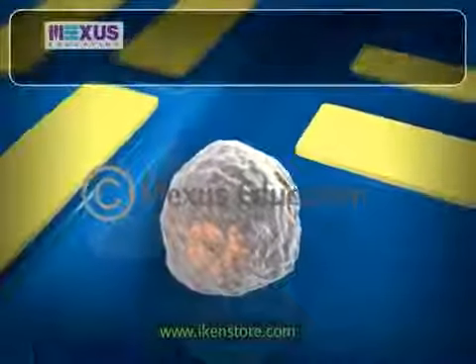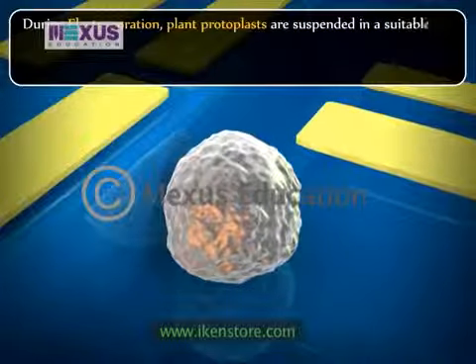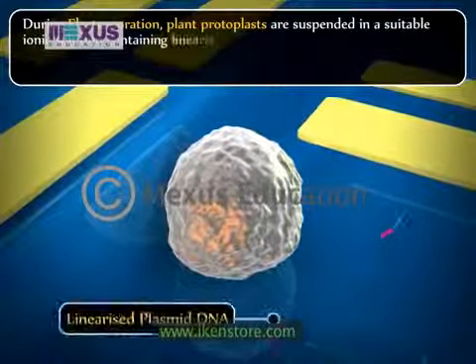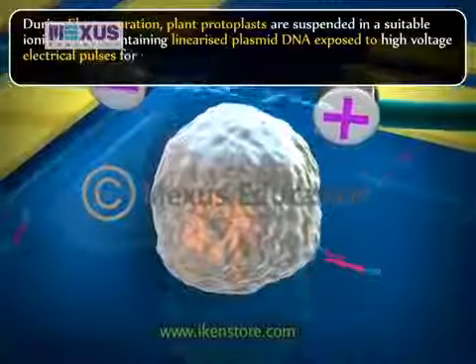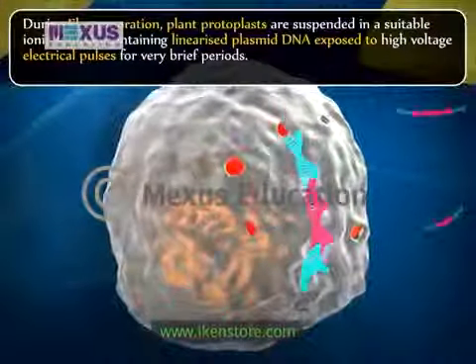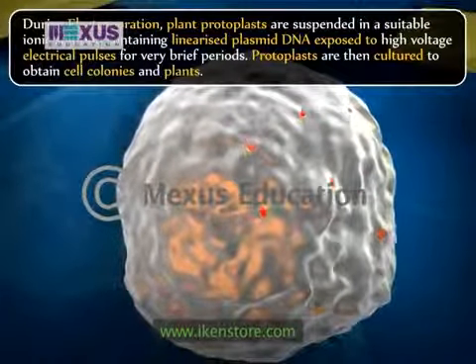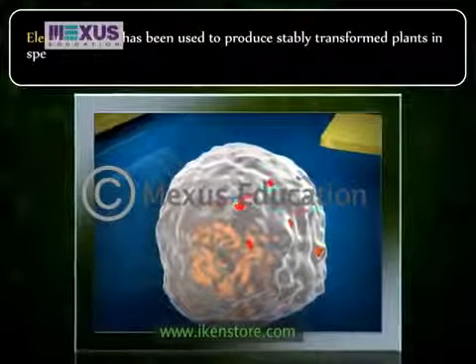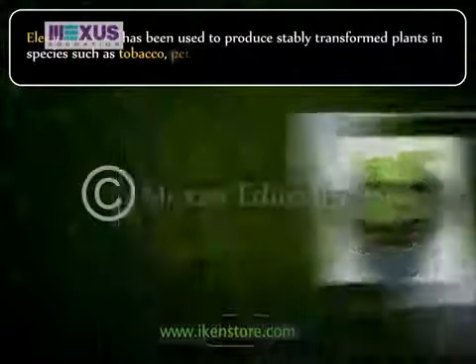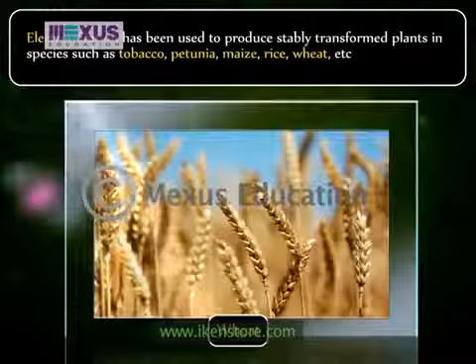The second method is electroporation. Plant protoplasts are suspended in a suitable ionic solution containing linearized plasmid DNA, exposed to high voltage electrical pulses for very brief periods. Protoplasts are then cultured to obtain cell colonies and plants. Electroporation has been used to produce stably transformed plants in species such as tobacco, petunia, maize, rice, wheat, etc.